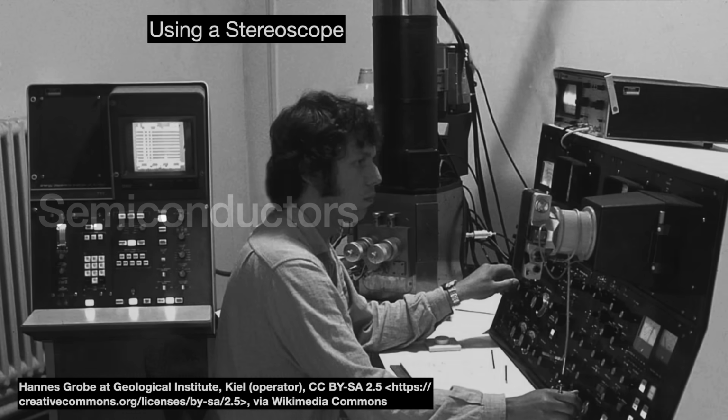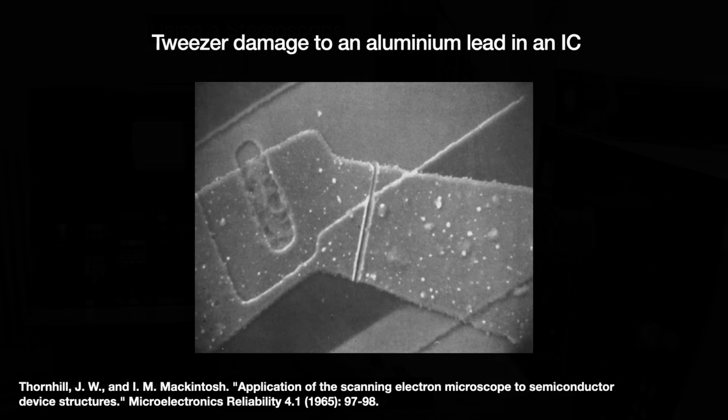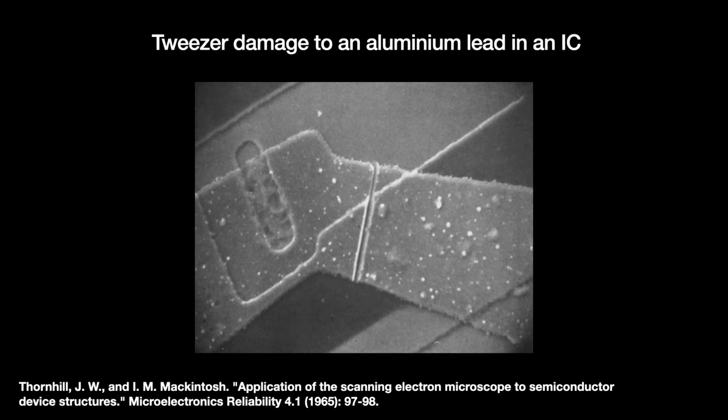the semiconductor industry has especially benefited from its bounty of gifts. The fact that you did not have to prepare replicas for samples made it far more convenient than the transmission electron microscope. Oatley realized this early on and assigned one of his students, Gary Stewart, to add an ion beam to the SEM for additional measurements. Though filters had to be added to remove oxygen ions from the beam, they were causing oxides to form on the surface of the etched chips.